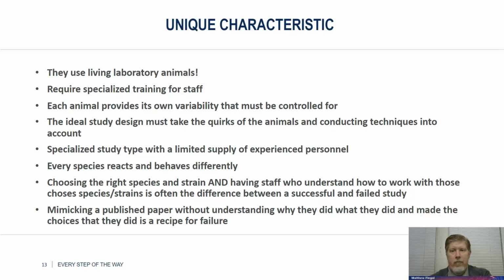Are they going to be playful? Are they going to be less playful? Do they want to sleep? Do they not like the perfume that a technician is wearing? Do they really like the laundry detergent that your scrubs were in? All of these things are variables, and the way the animals respond to them tend to be individualistic.